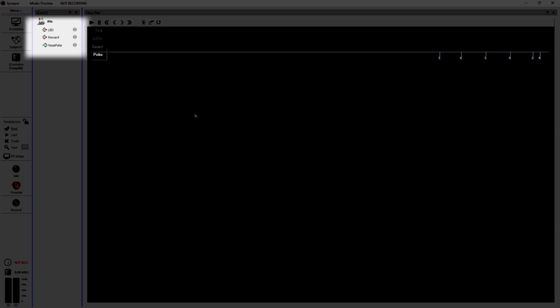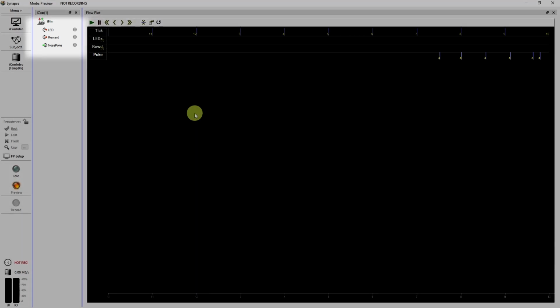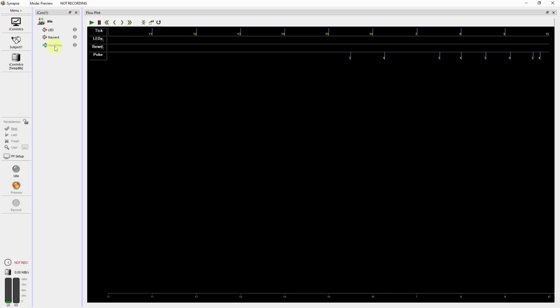Those values may seem odd, but we'll discuss in the duration testing section later on how you can add additional input logic to capture more information than just the on-off events. You can also manually trigger any of these events by clicking on them. This gives you the same behavior as if you press the hardware button on the front of the physical IH10. Since the outputs are simple on-off events with no other information, just the onset and offset timestamps are saved with the value of 1. You can see this in the flow plot if you click the autoscale button.